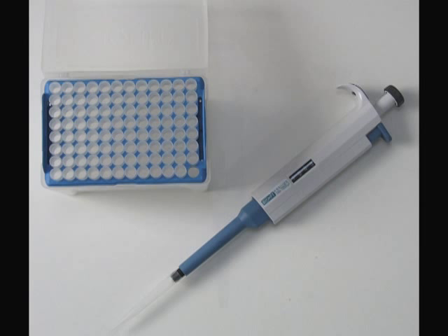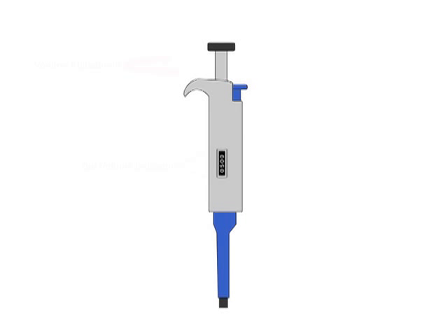Pipettes have multiple moving parts, so it is essential to know how it functions before using it. To set the volume, rotate the operating button clockwise or anti-clockwise until your desired volume is displayed on the indicator.